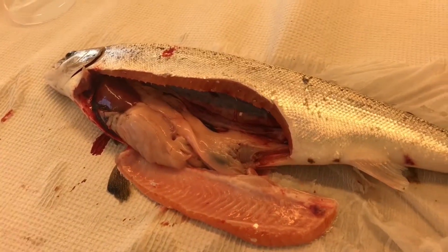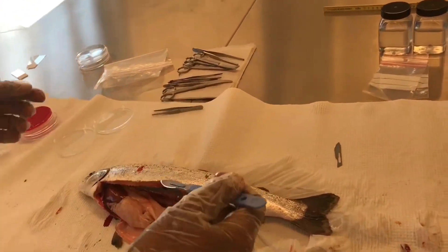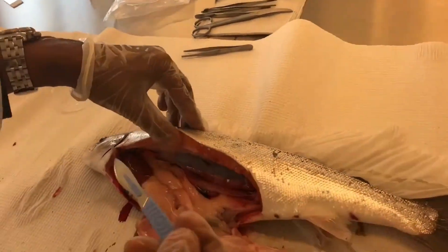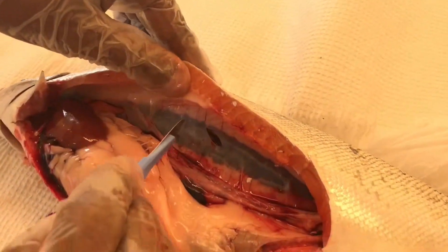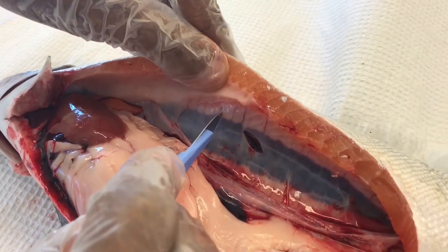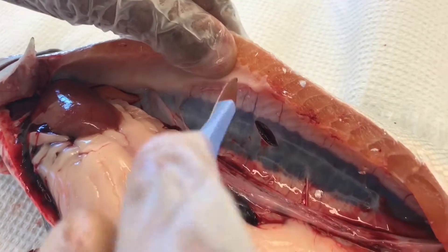Now we take samples into the transport medium and for RNA analysis. Let's start from the kidney. We can most probably take a good portion of the kidney, including the capsule.